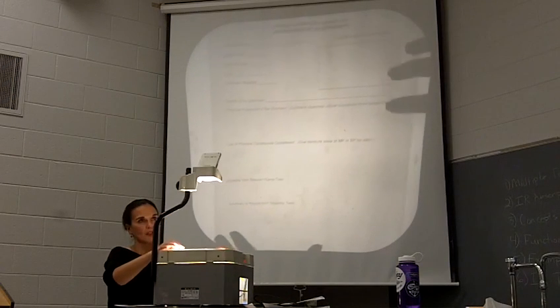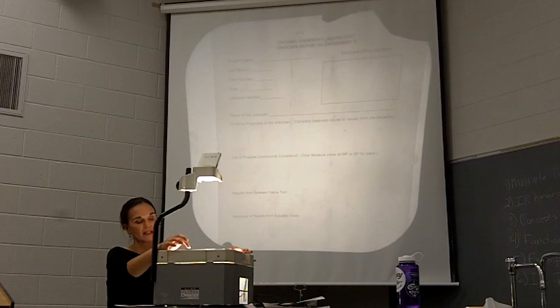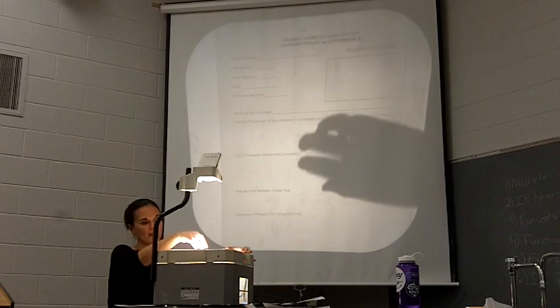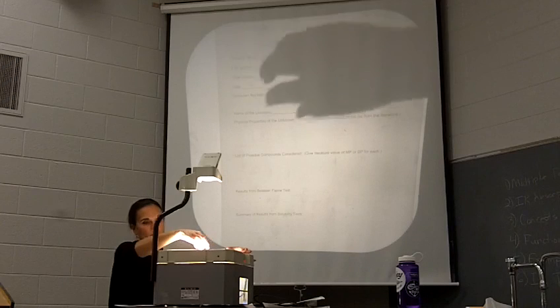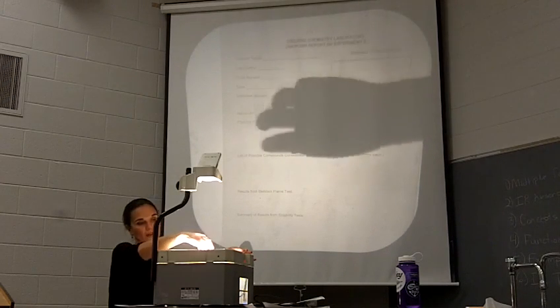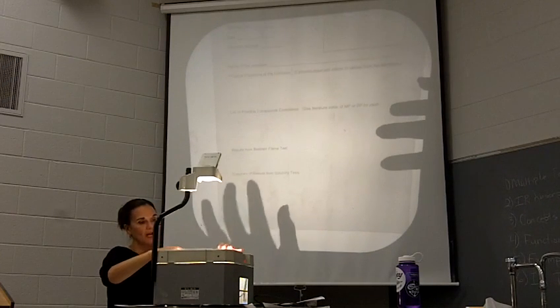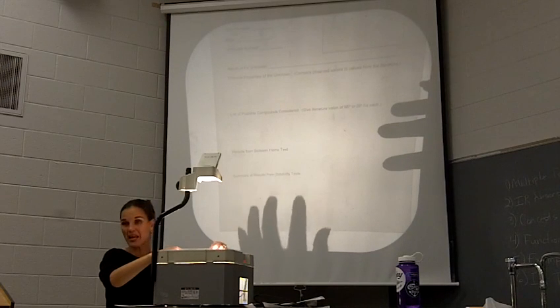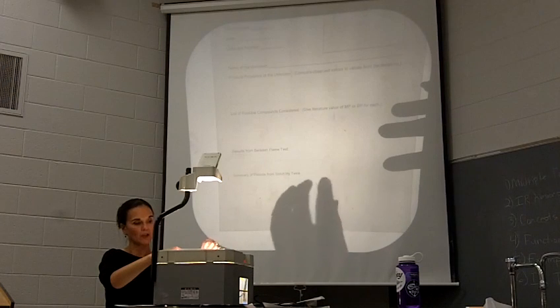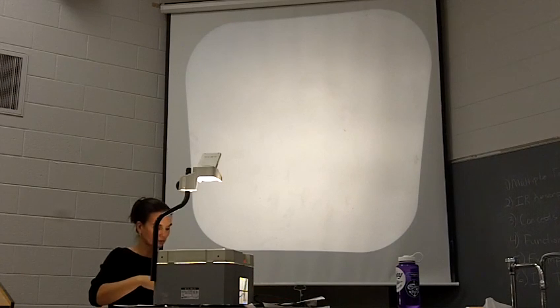is a report sheet at the back of your lab manual, pages 615 and 616. You've got a report sheet that you're going to fill out in different pieces: name, unknown number, what your unknown ends up being, the name of it, physical properties, melting point, boiling point, what happened with the flame test, what happened with the solubility test, which can be a table, just like the table you used for the solubility test. And then you can explain any differences or other observations you had.